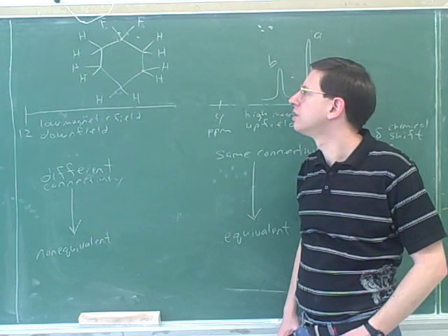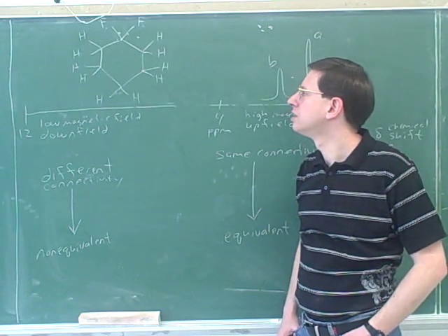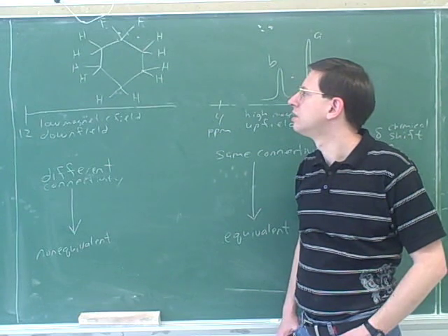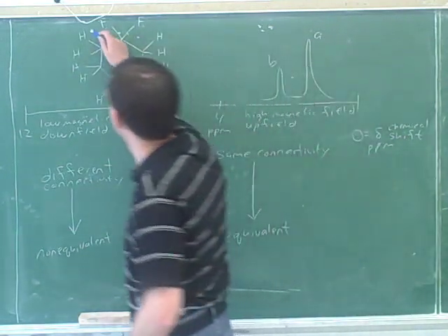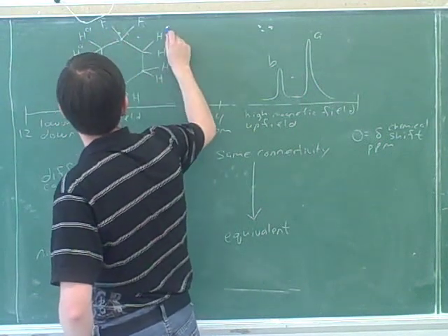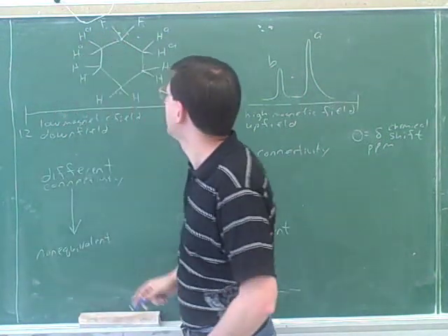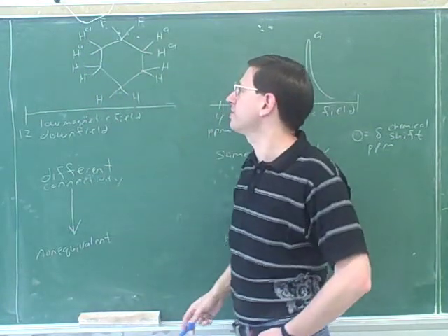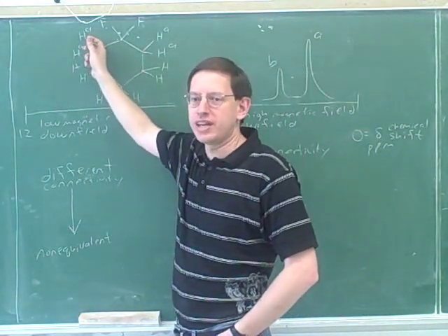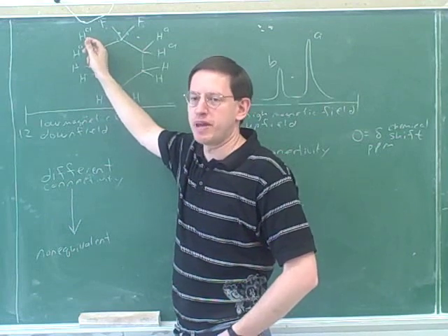So carbon, okay, let's see, those will be the same. I'm gonna say one. One peak? Now, are these hydrogens equivalent to these? No. For one thing, these are closer to the fluorines. Any difference in the environments is going to make a difference there.